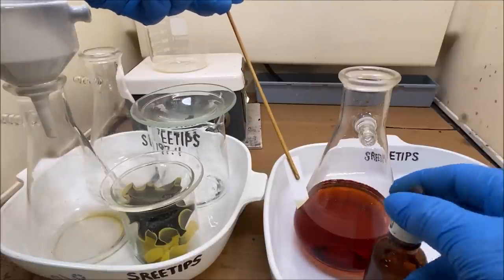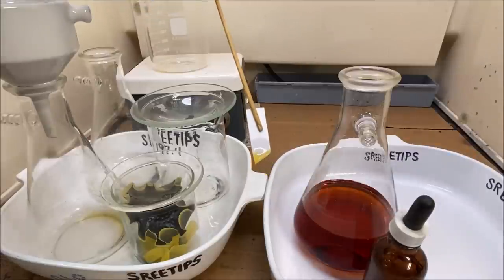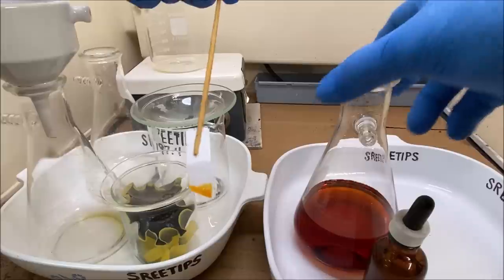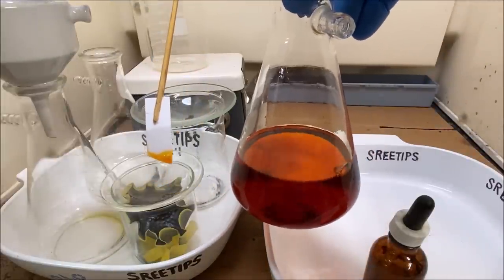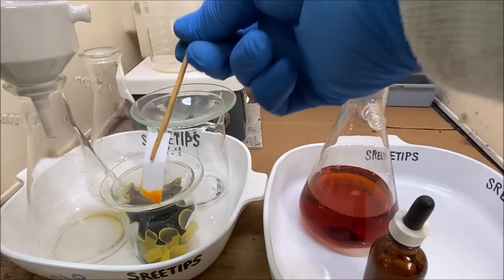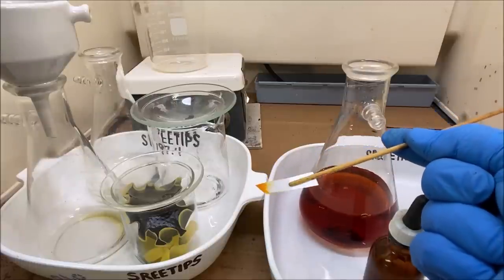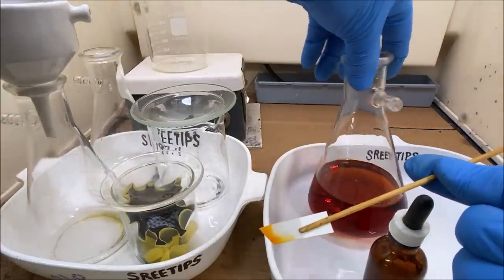Let's do a little stannous chloride test here. You can see we got a bright orange stain. This actually looks a little better. It looks a little bit more like platinum now that we've got the black solids separated from it. So what we'll do is we'll call it right here for part three. Got mostly platinum in here, I believe.